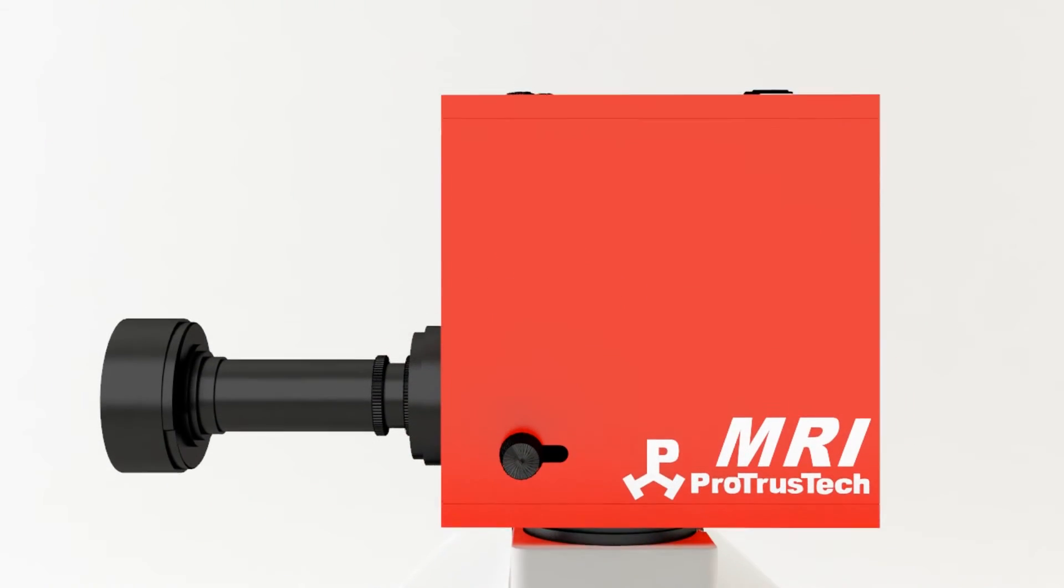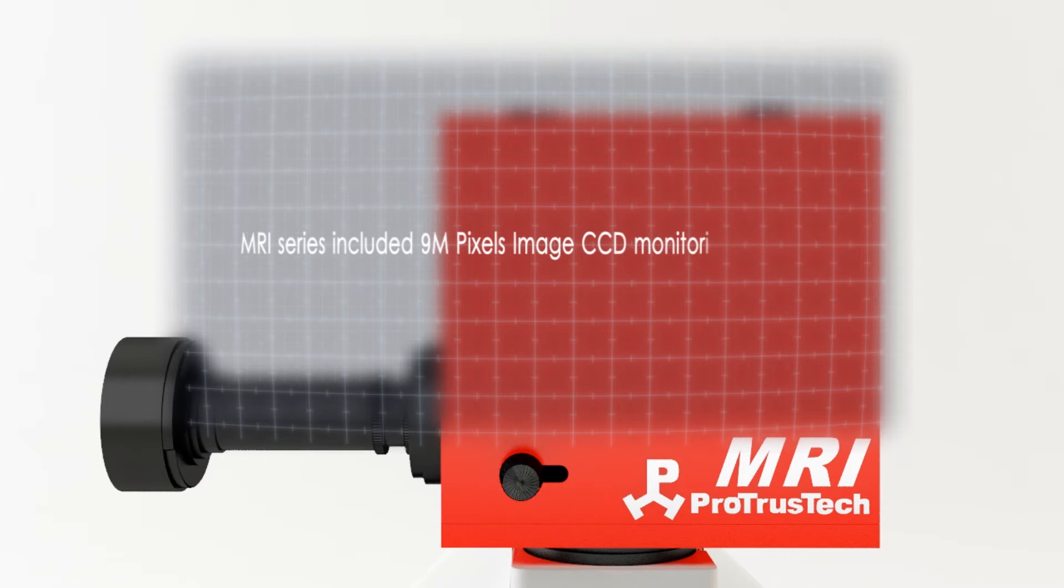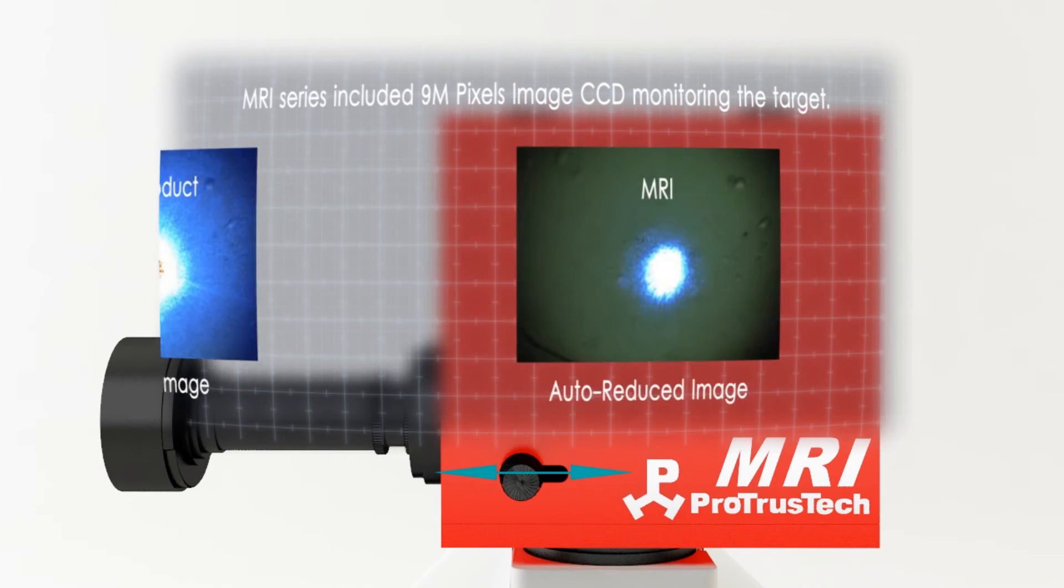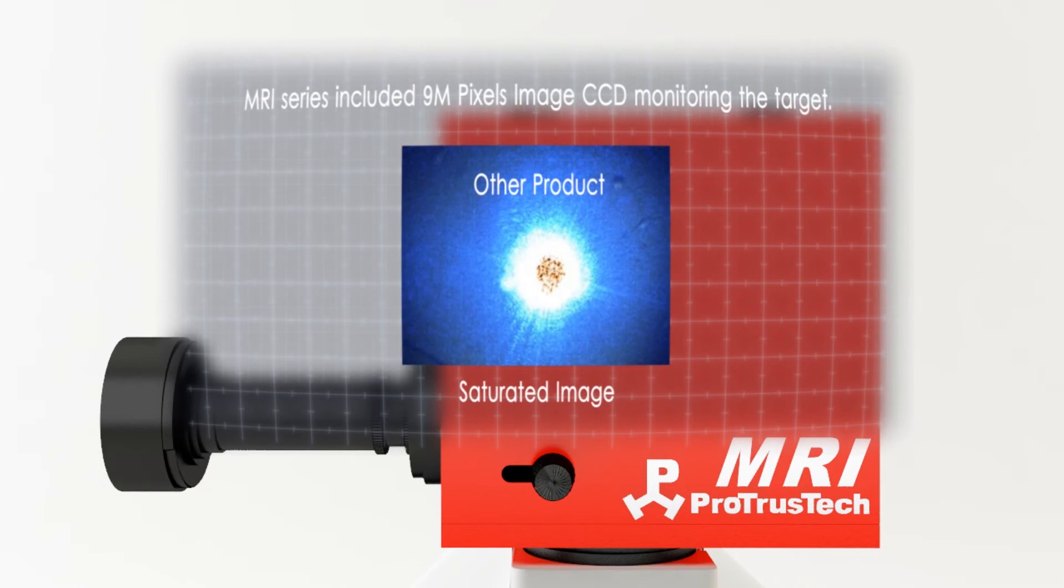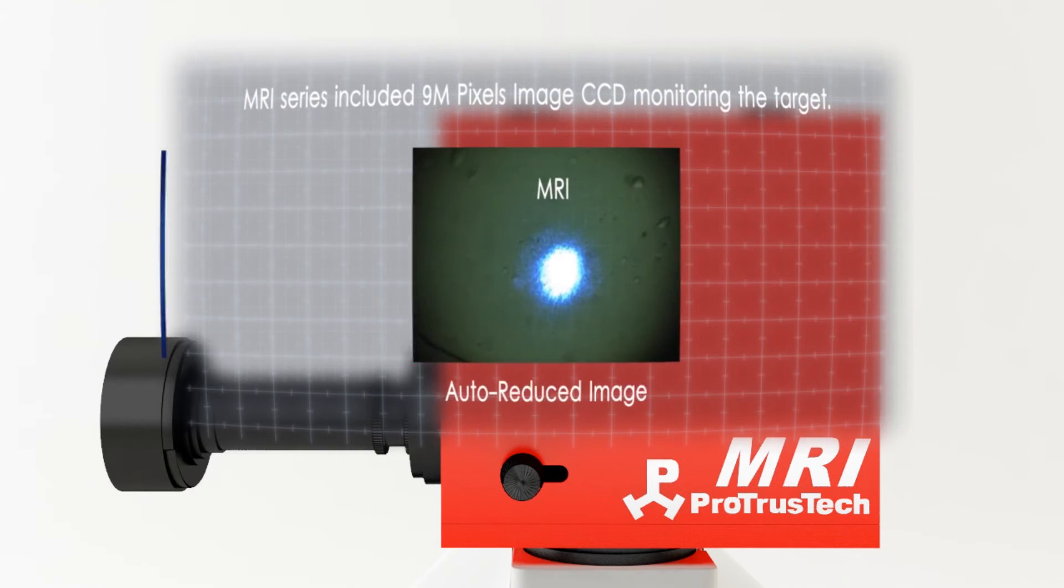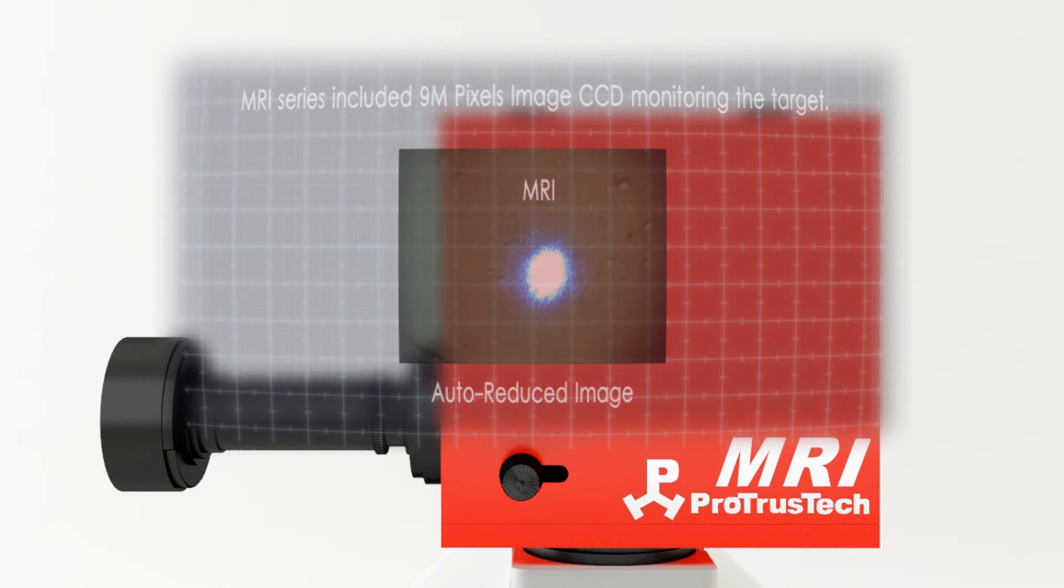MRI is equipped with a 9 million pixel CCD camera, allowing you to clearly capture microscopic sample images. Moreover, our MRI carries with itself a built-in laser goggle function which, when switching to image mode, will automatically adjust laser power to minimum amount, preventing images from overexposure.